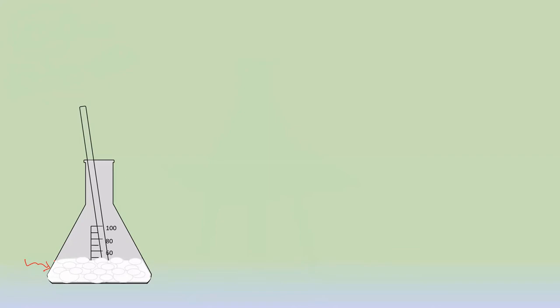Right now in the conical flask, I have benzoic acid in the solid form. So till now what we have done: we have taken in the conical flask 1 ml of ethyl benzoate. In that we have added 10 ml of 10% aqueous NaOH. Then we have added 3 to 4 ml of water. We have boiled the solution so as to get complete hydrolysis, and in that solution we have added concentrated HCl to get the benzoic acid.